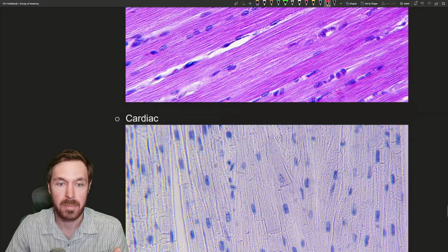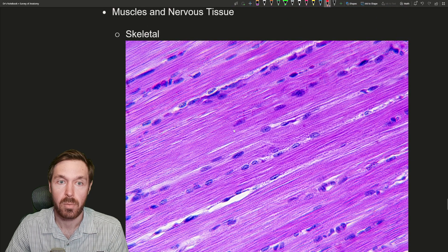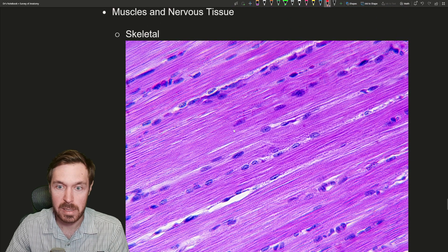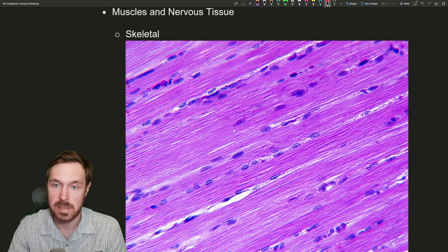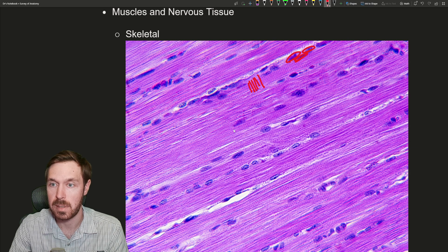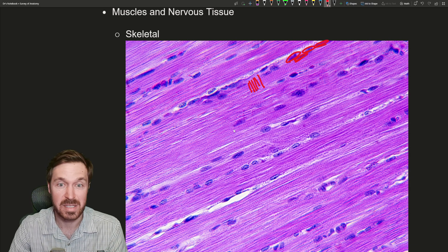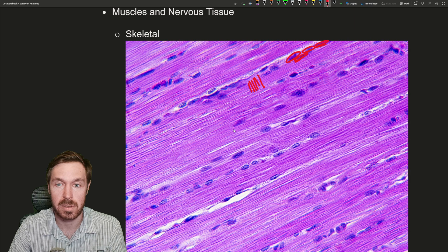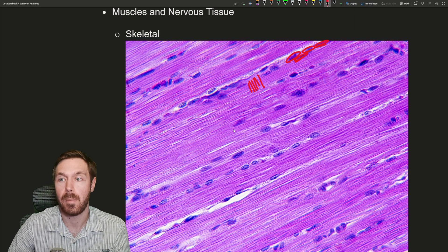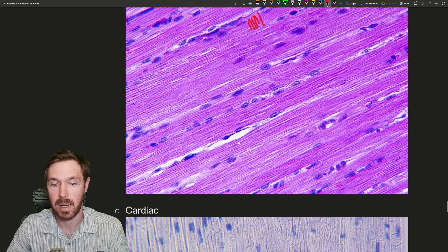Now the three types of muscle. First is skeletal muscle. In skeletal muscle we see striations — the overlapping of thick and thin filaments creates this striping pattern. It is multinucleate, so these muscle fibers have multiple nuclei. Skeletal muscle is also voluntary, though you can't see that in an image. Here we can see the striations and all these nuclei clearly.